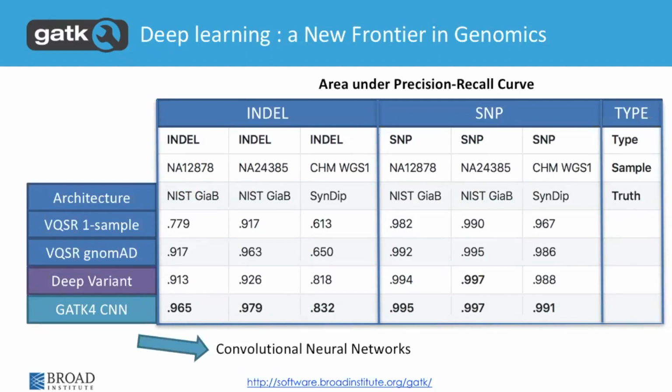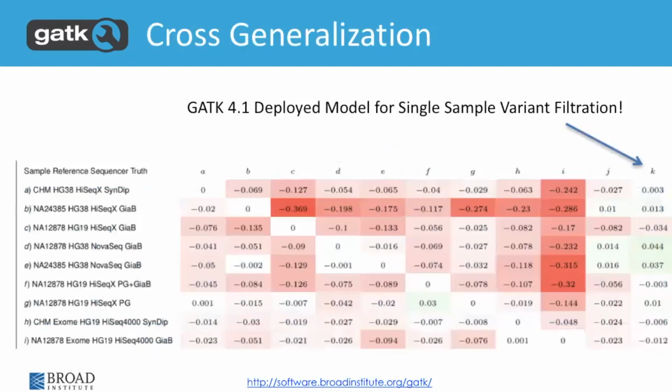So I know that retraining the model is a concern for production, particularly for new data types, because there is a lot of new information. Right. So what we did is described in this column. We did an experiment on how generalizable the results are if we train on one data type.